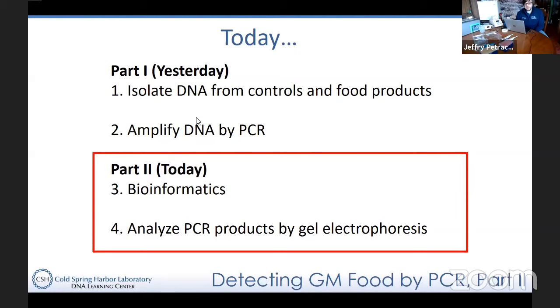For today, we're going to take a look at the results of those PCR products by the process known as gel electrophoresis, where we'll actually be able to visualize our PCR products and see whether or not we got successful amplification of both tubulin as well as 35S. We're also going to do a few bioinformatics exercises — the study of how to deal with large data sets of biological data, such as genetic information.